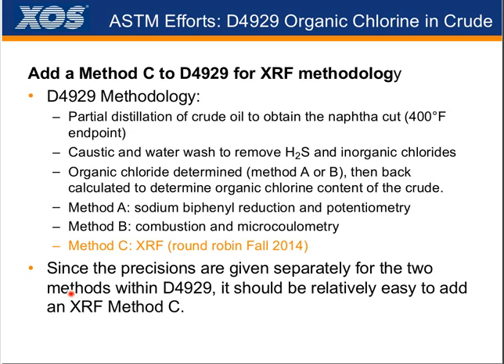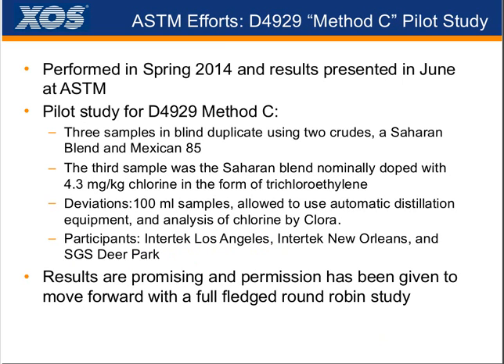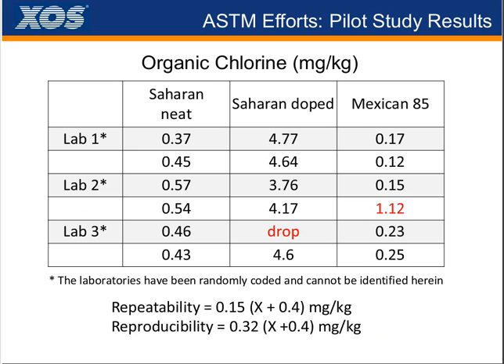Since the precisions are given separately for each of these different methods, it should be relatively easy to add a method C to this. And I know our ASTM team here, headed up by Leslie, are working very hard on this. We presented some results back in June at ASTM, and we're preparing a pilot study. We did an initial pilot study, and now we're preparing for the larger study. And I can show you the pilot study data here.